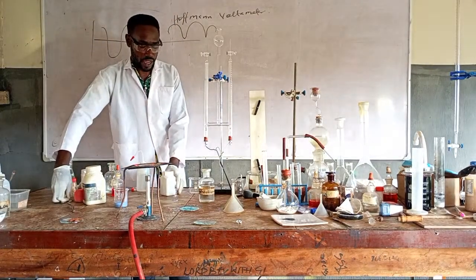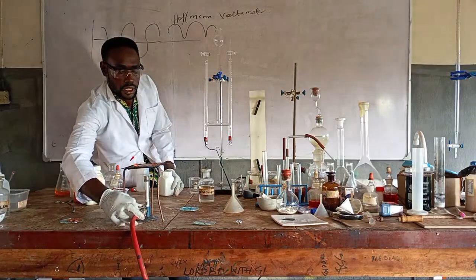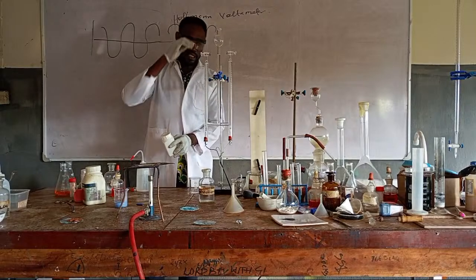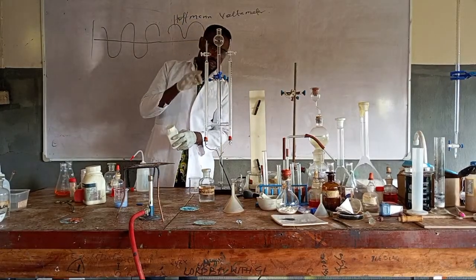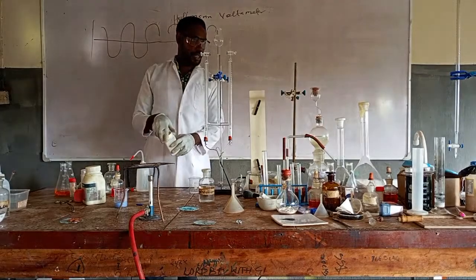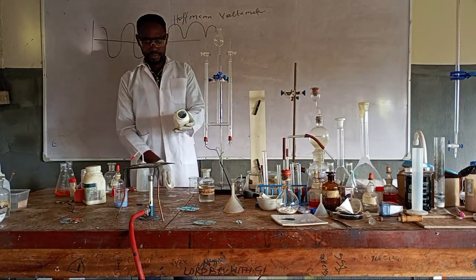Pink. So over here, I think we turn off this to reduce the heat and save energy. This is very, very slow, but you are seeing that it's going down. Okay, over here is the paper.